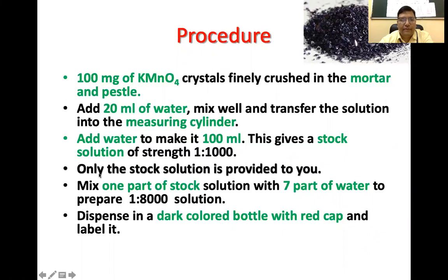Only the stock solution is provided to you. That means when you are in the lab, this stock solution is already prepared for all the students. You have to mix one part of the stock solution with 7 parts of water to prepare the 1:8,000 solution. Since you require 1:8,000, you will mix one part of this stock, that is the 1:1,000 solution, with 7 parts of water.